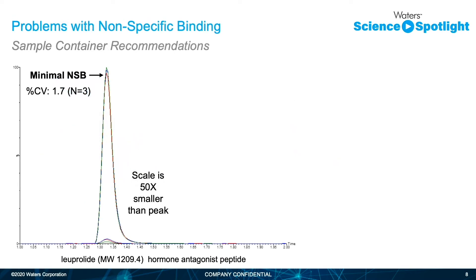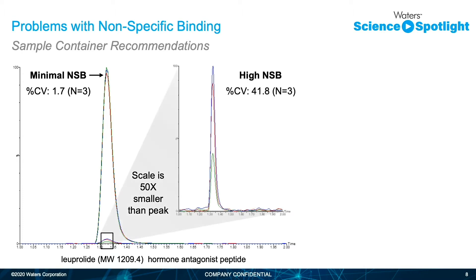Here the impact of nonspecific binding is depicted by therapeutic peptide luprolide. There are two different sets of peaks — one large, one small — but the only difference is the care taken to mitigate the nonspecific binding. In the mitigated case, we see far more sensitive and reproducible chromatography. Without that care, the percent CV increases to just about 42% and the peak is 50 times smaller.